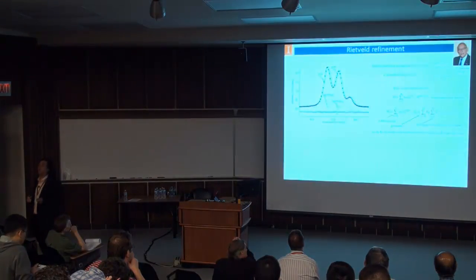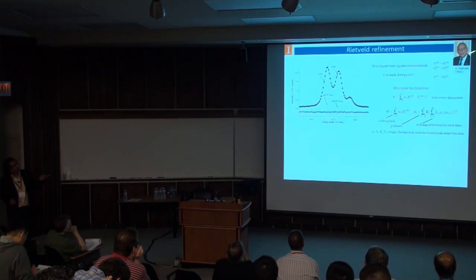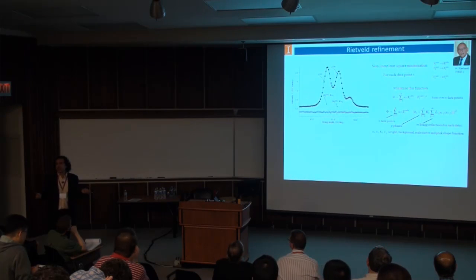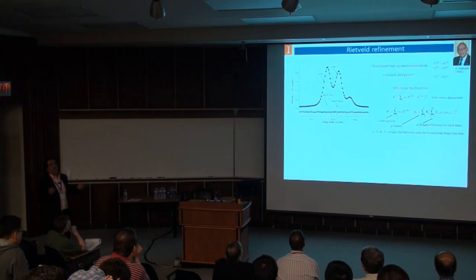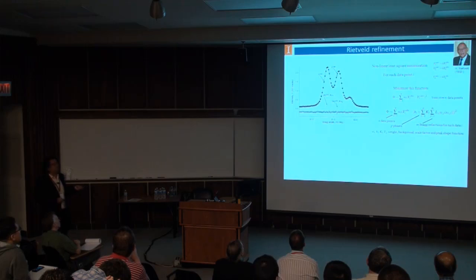If you want to be more rigorous, you have to do something that this fellow looking up at you, see there, developed: Rietveld. Many people do that. Nowadays, the software is very established. What this does is that for each data point in the curve, including the background, you minimize the difference between the measured and a theoretical curve. You do that through software to minimize it, and then you get a structure refinement that comes from the software.